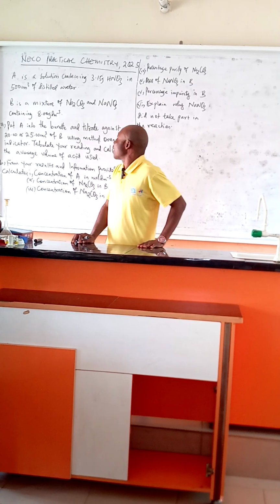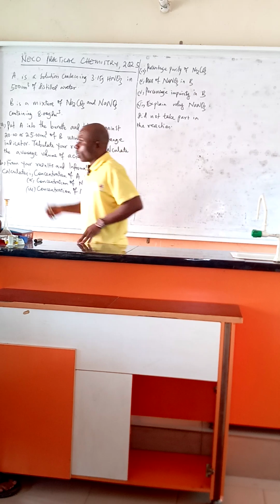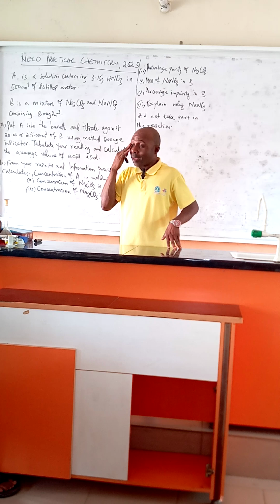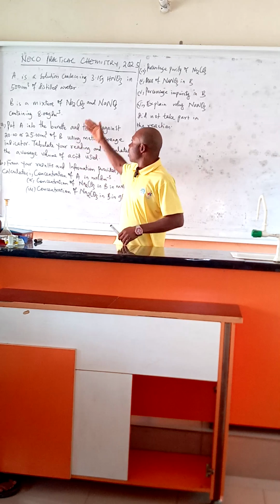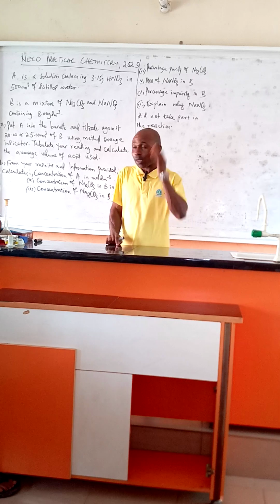Welcome to chemistry lesson, NECO Practical Chemistry 2025. This is a predicted question. It may not be 100%, but I assure you that this will give you a guideline on how to go about question number 1, volumetric analysis.